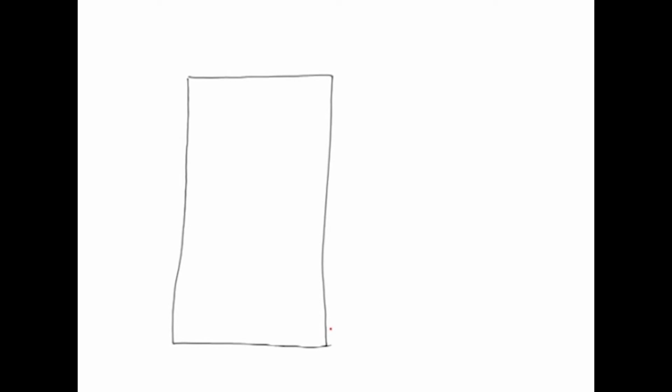Like I said, first thing is you have to spot your samples on this paper. This paper could be simple paper or it could be derivatized for other applications.